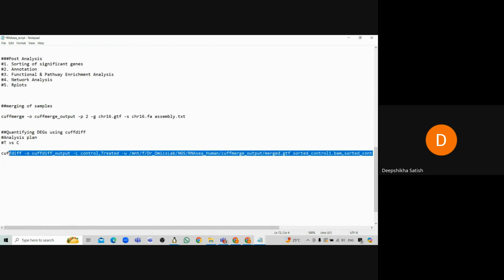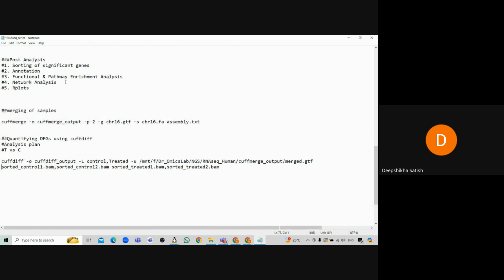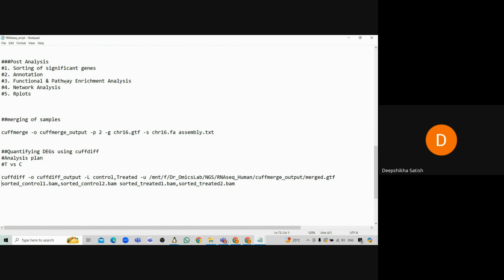So this is our command ready for the differential expression count. I will just give an enter for now because you need to see the command properly, but you just have to put it in a single line. Is it clear? Can you just try this command and keep it for running so that it generates our final output of differential expression?